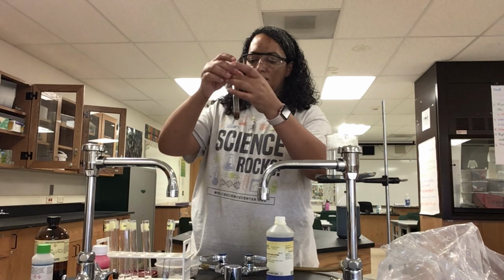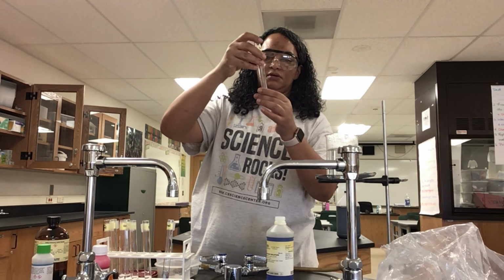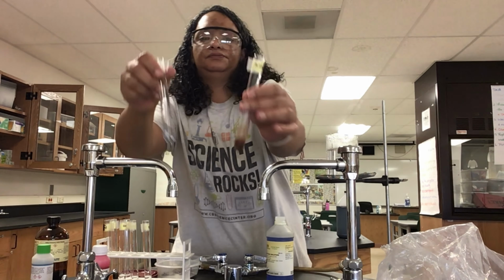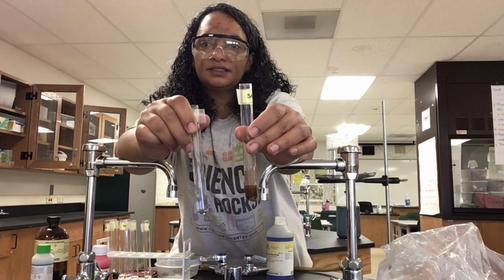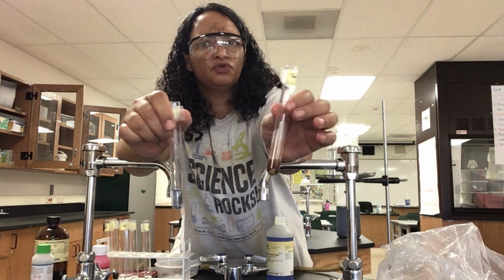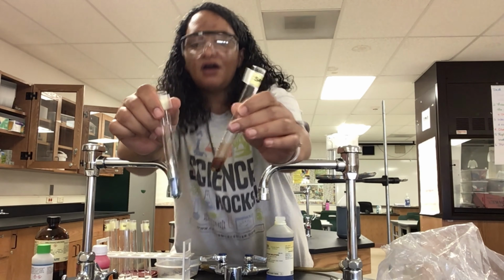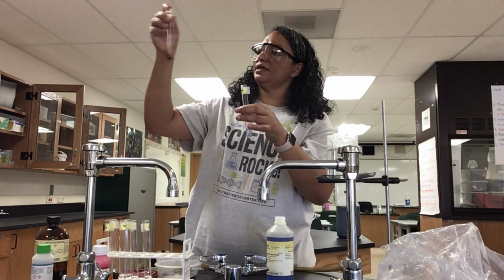Okay, so mixing it up. Oh yeah, that's nice and dark. So here's my control, which is a nice light blue color, which is kind of hard to see. I should have worn a white shirt, that would have made sense. And then here's my seed. So it's hard to see. Let me mix it up a little more.